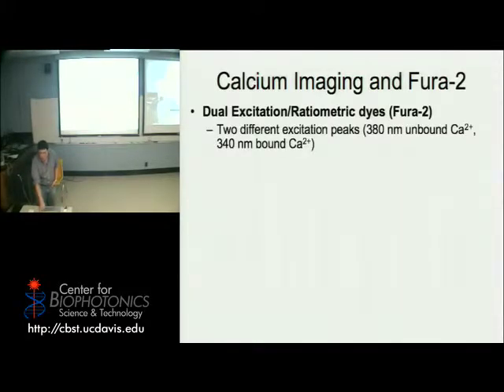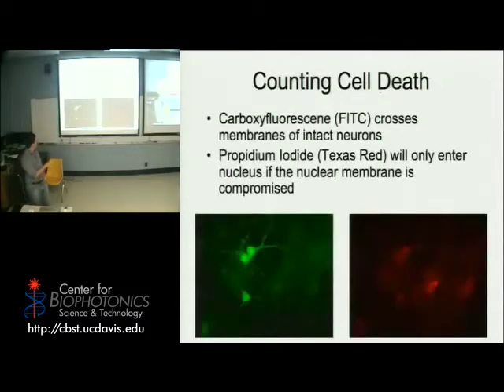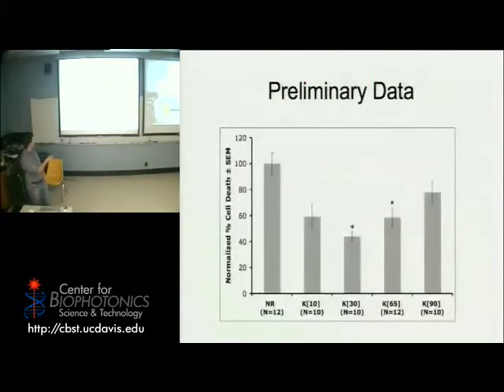Over what time period do you observe the cells? It's 24 hours. Many of them are still alive after that time. Some of them die. That's what we're looking at, comparing living cells to dying cells. I should have gone over that the y-axis is percent cell death. I take the total number of living and dying cells and then divide. I don't remember if I divided by living or dying, but basically, if we call this maximum cell death, there's a reduction in cell death. It's not 100% of cells dying, it's just maximal cell death. Oh, that's this one here, normal ringers, I'm sorry. Normal ringers, yeah. So that's 100% cell death.